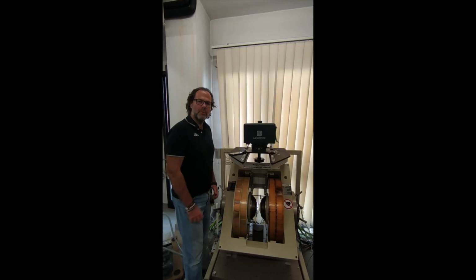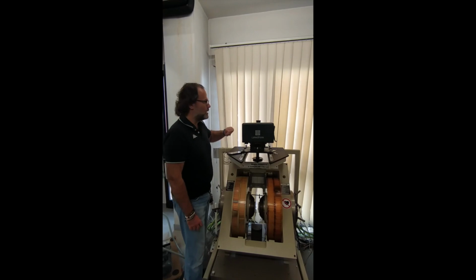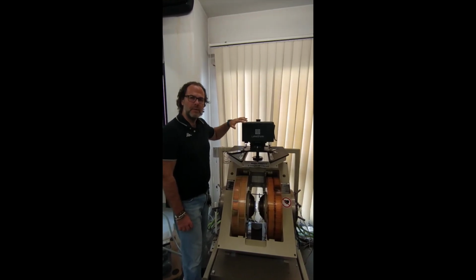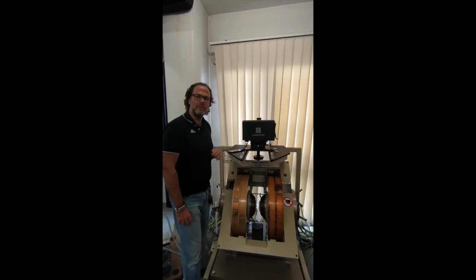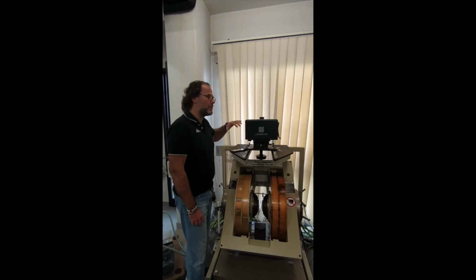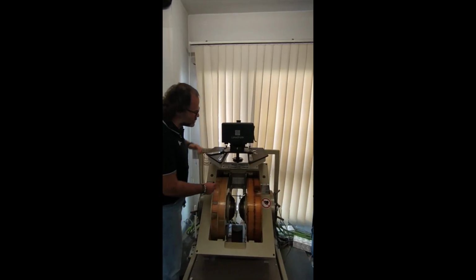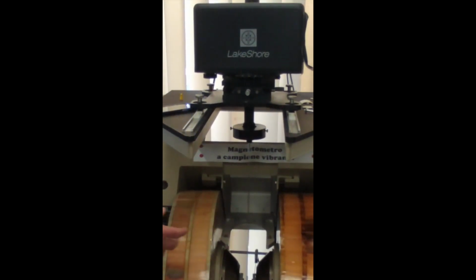The second core component of a vibrating sample magnetometer is the vibrating head, which is a linear motor that is encapsulated in this box here. The role of the box is to keep the temperature constant of all the vibrating material, because as we have seen in the theoretical lesson, it is extremely important that the system is capable of keeping the vibration amplitude and frequency constant during the measurement. The head is this linear motor to which the rod is attached that goes to the gap of the magnet, and there the sample will be installed.